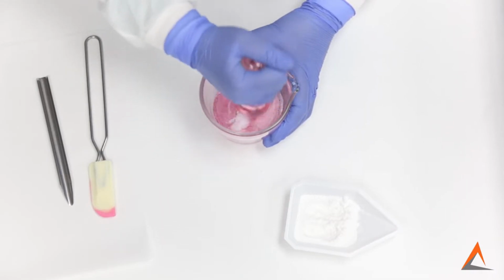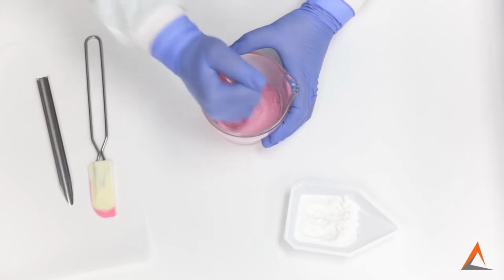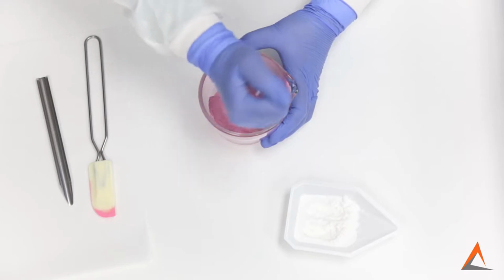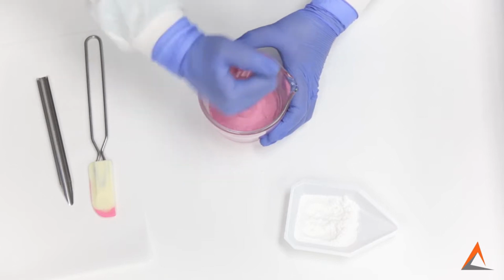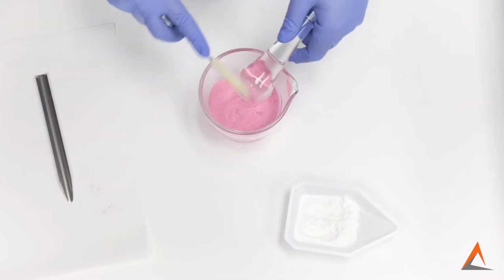When we have an equal quantity of lactose powder added to the mortar, we're going to triturate again. Make sure you have a nice, firm grasp on the pestle to get full contact of the pestle along the sides and bottom of your mortar to really grind down the particle size of the powders. Once again, after we're done mixing, we scrape down the mortar and pestle.